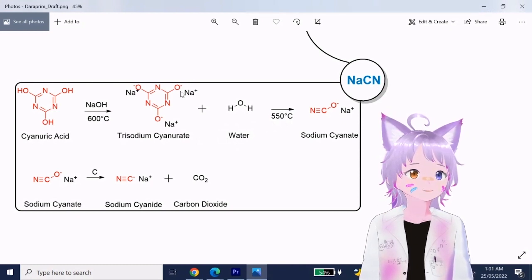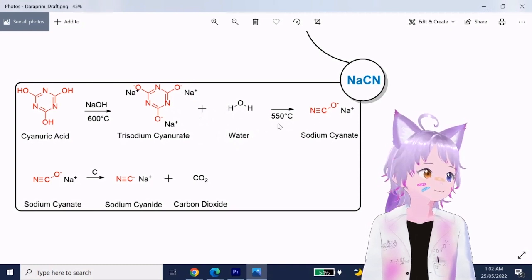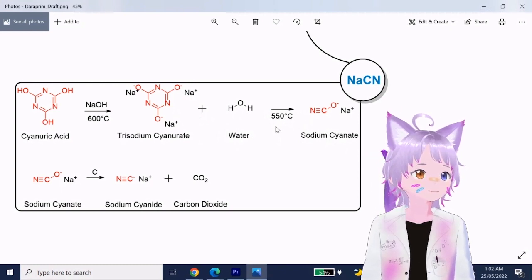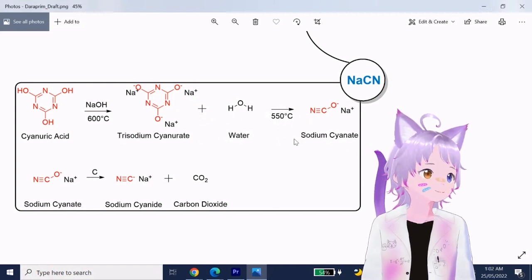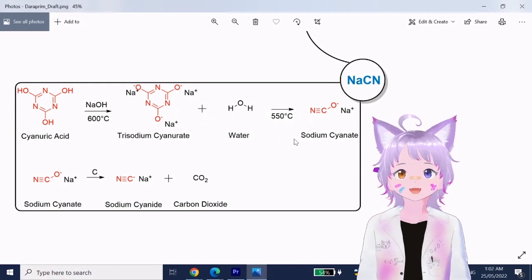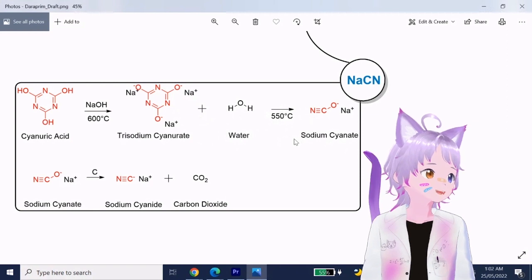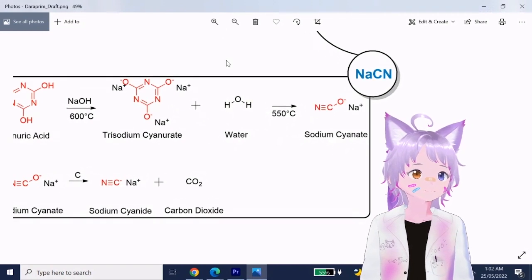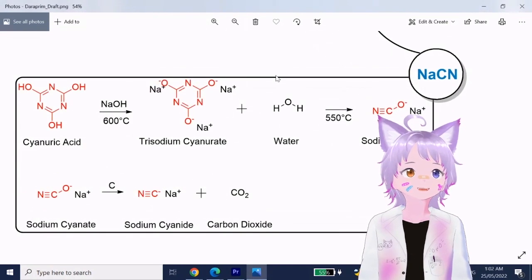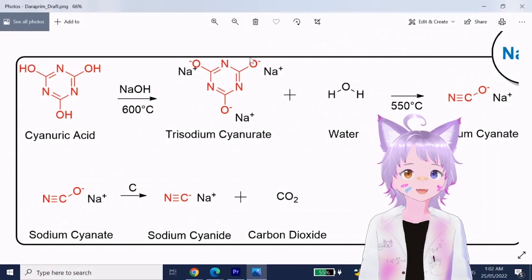Then, I know. So basically, in this step, we separate out the sodium cyanate from the rest of the junk and maybe form some iron compound with it, or stick with a sodium compound since we're going to turn this into cyanide with the carbothermic reduction anyway. I think if we find a way to separate the other crap from the sodium cyanate, we can have a non-toxic, safe way to separate the two compounds before turning it into deadly poison. How does that sound?